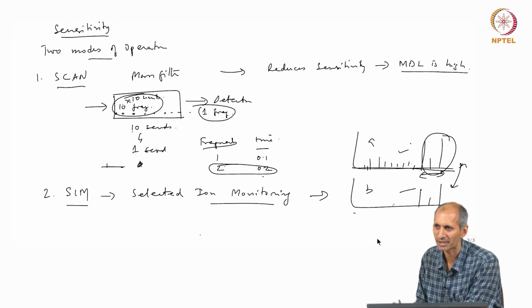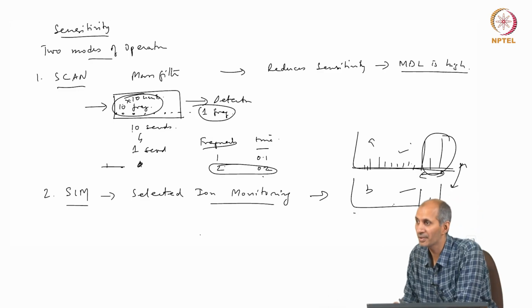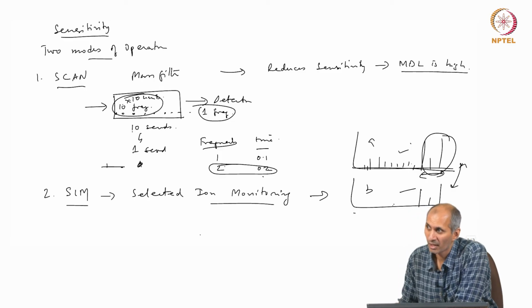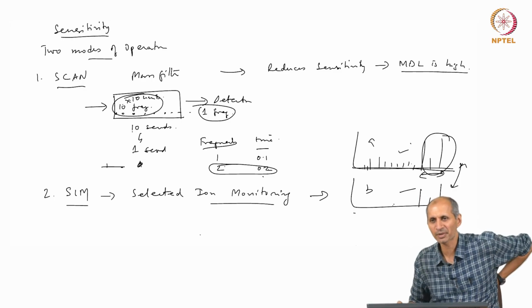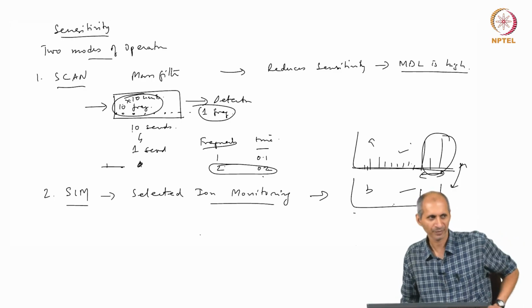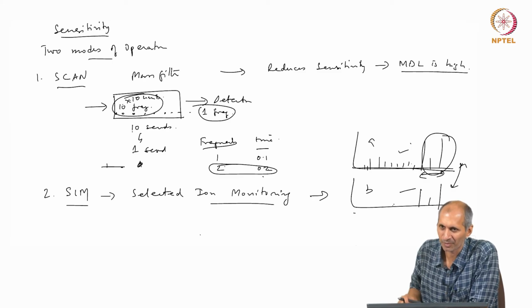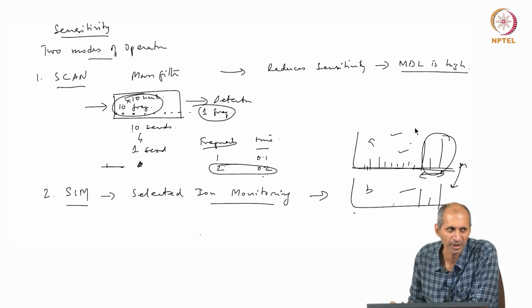What is the consequence of that? The calibration would be different. Huh? As in, if your match is not perfect, then your calibration would go. Calibration is different, but right here, we are using mass spectra for something. What are we using mass spectra for? For many compounds. Yeah. Here we are analyzing only one, yeah, but what can you not do with this? With this spectra, with A, I can do something. So I cannot do that with B.